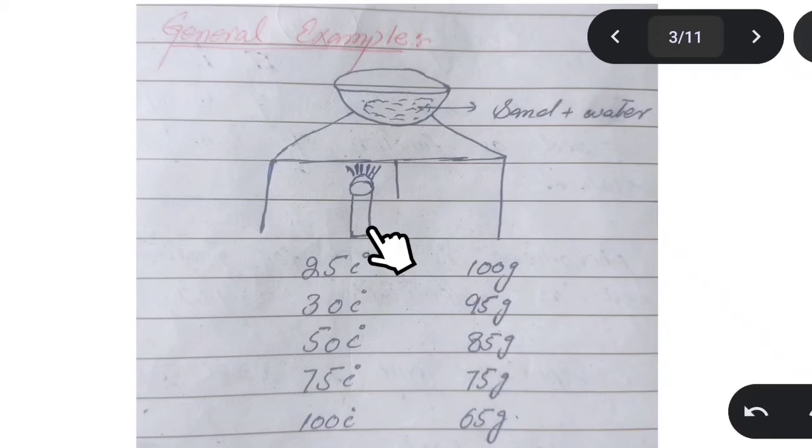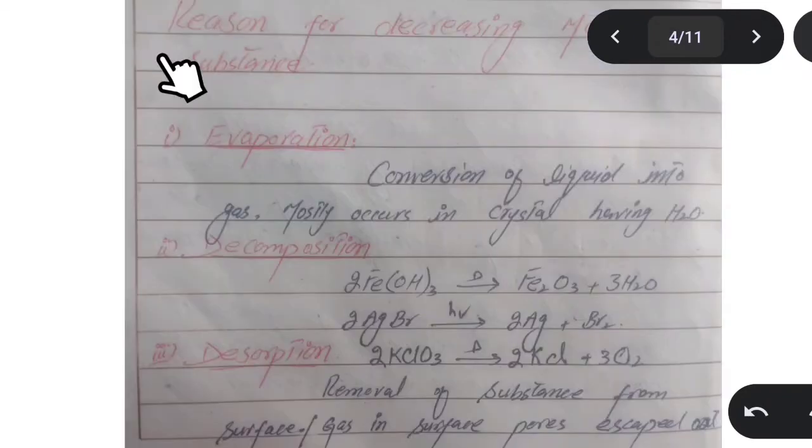Why is this mass decreasing? Because, as we know, water also has weight. By increasing the temperature, the water shifts from the liquid state into the gaseous state. This phenomenon is known as evaporation. So as the temperature gradually increases, the mass of the substance gradually decreases, but this will happen in the case of a substance where evaporation is going to take place.